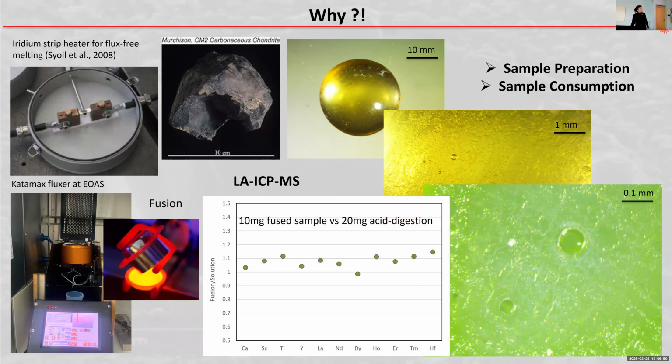And you will get data that are comparable to what you would have gotten with solution ICP-MS, which we did for quality control.